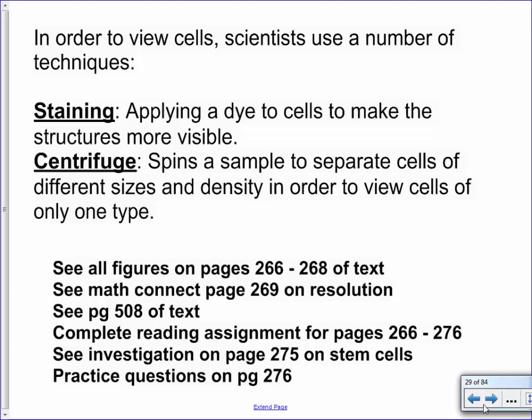Medical professions use contrast. Like they put a dye into, say, an organ, perhaps, the idea being that then it'll show up under an MRI or an X-ray or something along those lines. You guys ever seen that in a medical drama before, where they had a contrast dye to help things show up? Same concept. Oh, yeah. Okay.